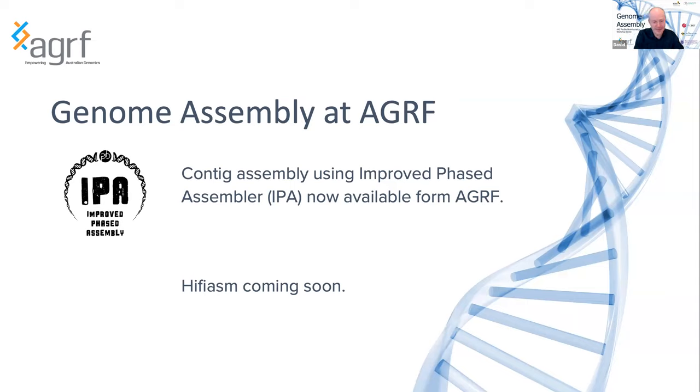I'll just quickly cover off a brief announcement from AGRF. For those of you who work with AGRF, you'd already know that we provide subread data and CCS data and some metrics about how the runs have gone. We've so far left assembly to be handled by the client, and we've been a bit cautious about getting into the assembly side of things based on our experiences with short read assembly. However, as you've heard from our previous speakers, long read assembly on the PacBio is quite mature now and has been for some time.